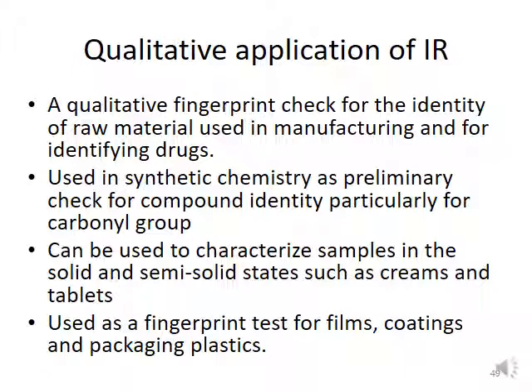Next, it can be used to characterize samples in the solid and semi-solid states such as creams and tablets. Basically, if you have a cream as your sample, you can simply scan it directly by using infrared spectroscopy. And if you have a tablet, then you need to crush it first, or just put it on the ATR and give it some pressure, and then you can simply detect the signal of the scan by using infrared spectroscopy.